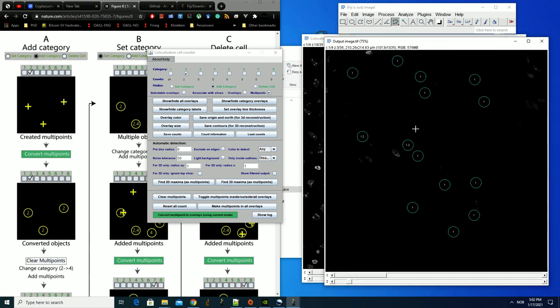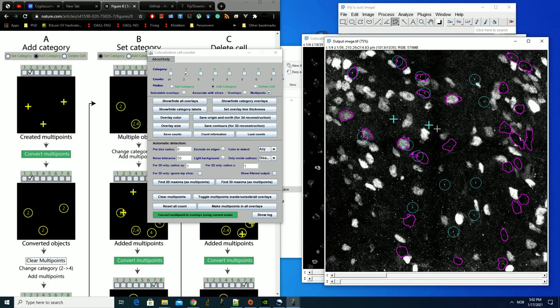Like now you see that you actually have some representation of these multipoints in different slices, and you can do the same with the overlays, these circles, on and off. And so you see here, if I now take this off, then it will just be in all the slices. So these are some options you have to choose to work in 3D or 2D.